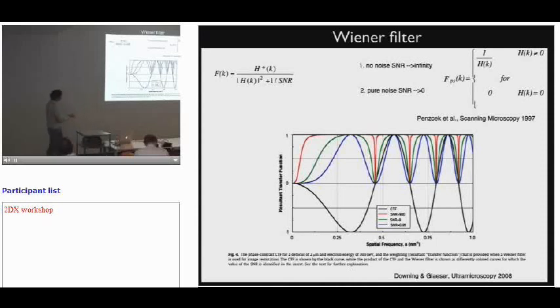The regular cryo-EM case signal to noise is set around this 9, although it seems to be rather optimistic. And there you recover certain bits, much more information. But if you have a much better signal to noise, then you actually can recover most of the information except for these very tiny bits. And this is the basic idea of this.